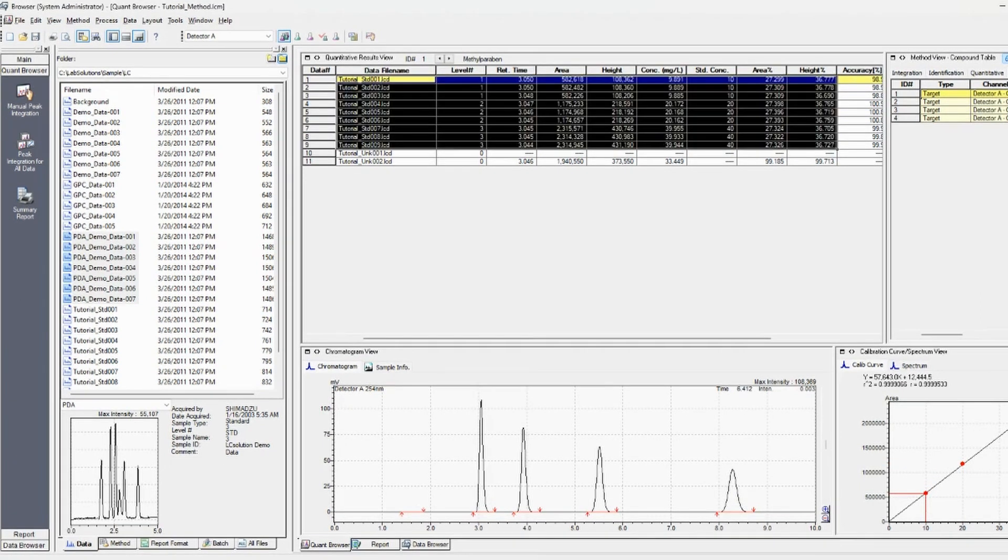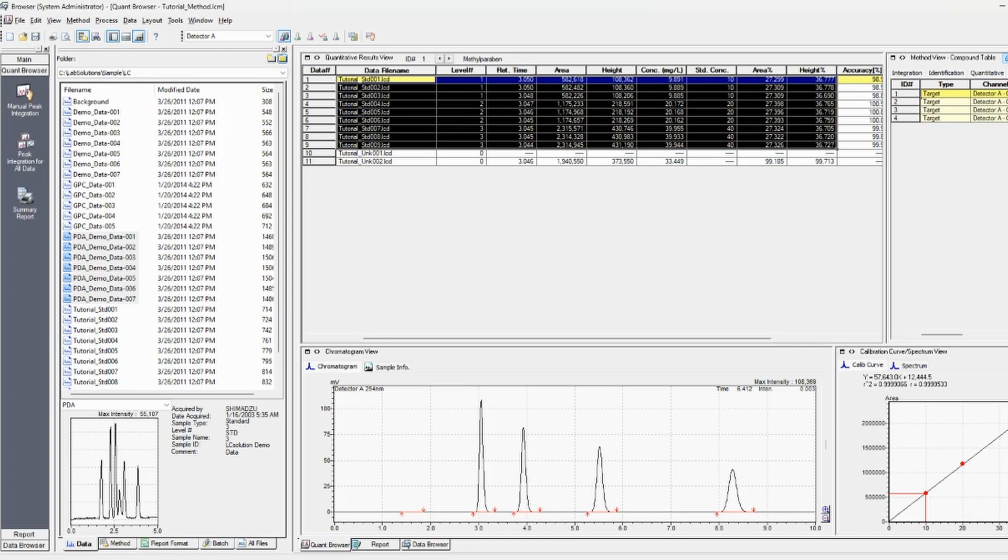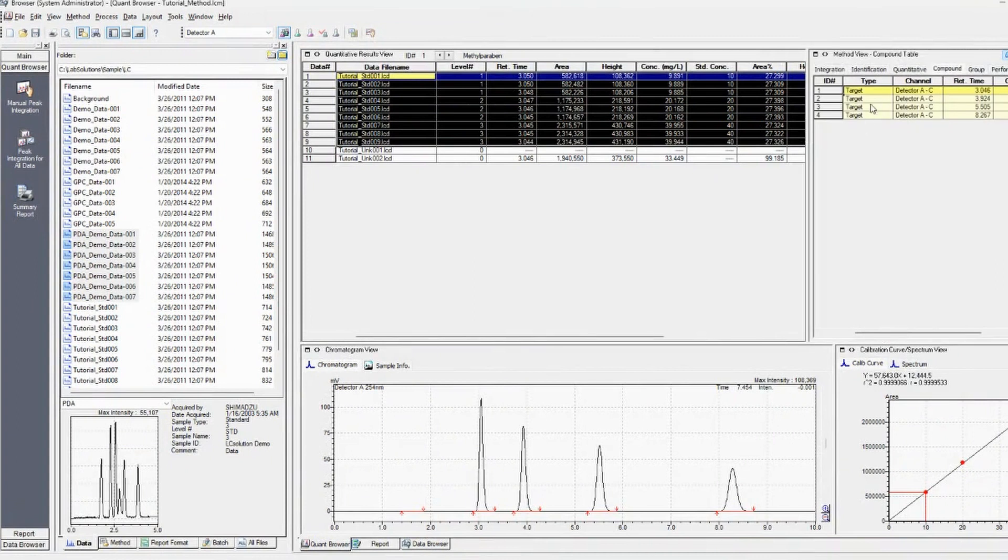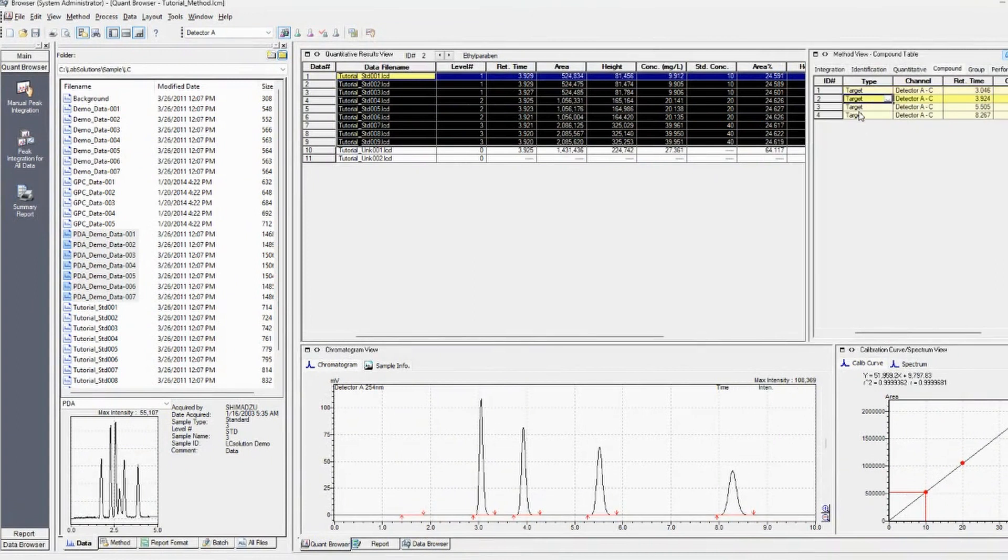And so what browser does is it only gives you one compound at a time across all the different files. So you'd have to actually go back to browser and just toggle. So if you look over here, toggle the targets, and then you can copy it and paste again if you'd like.